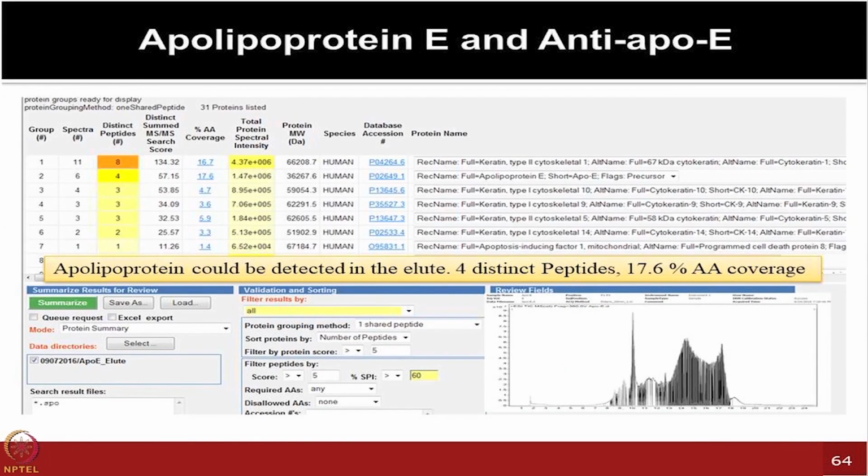So then we tried on another protein which was of physiological interest, apolipoprotein E. And the intention was again to look for their binding. This time we could see 4 distinct peptides. So at least the good news was, and we are using QTOF platforms, not the latest Orbitrap technologies, we could see the right protein and detect the right peptides, which was good news.